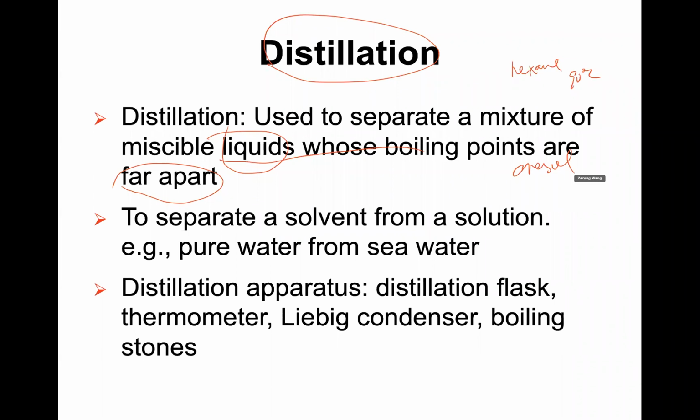This one has a boiling point of more than 200. So you can certainly heat the temperature above 120, allow this to vaporize, and then you can remove that. After that, you can remove another one.